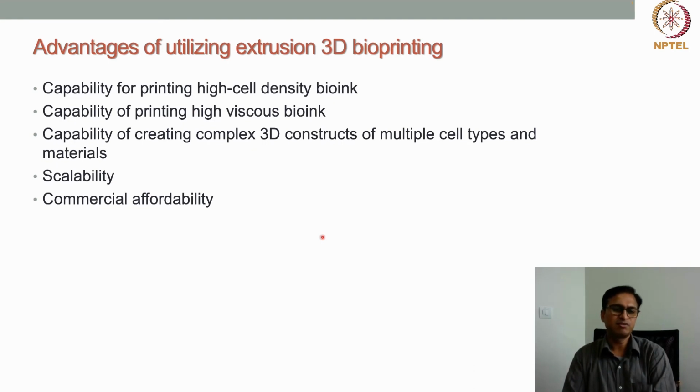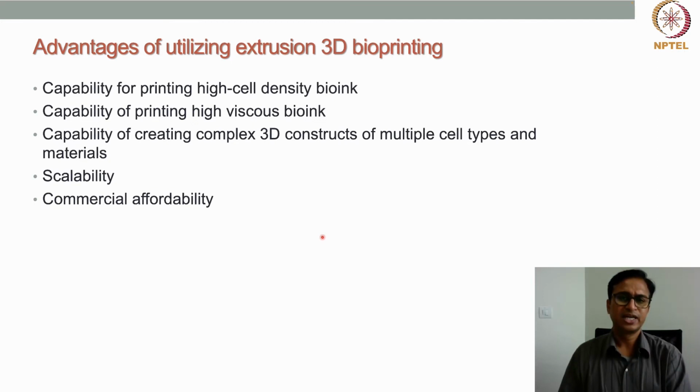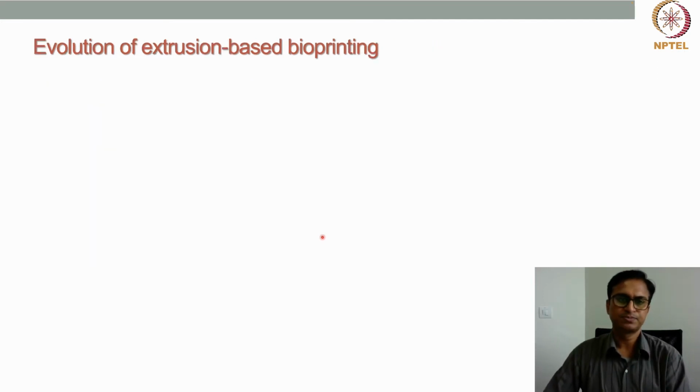The other thing is commercial affordability. Extrusion bioprinters are very much affordable. Many vendors and bioprinting companies are available who provide this kind of extrusion bioprinter, and those are very much affordable. So commercial affordability is another advantage of this technology. So these are some advantages of extrusion bioprinting technologies.